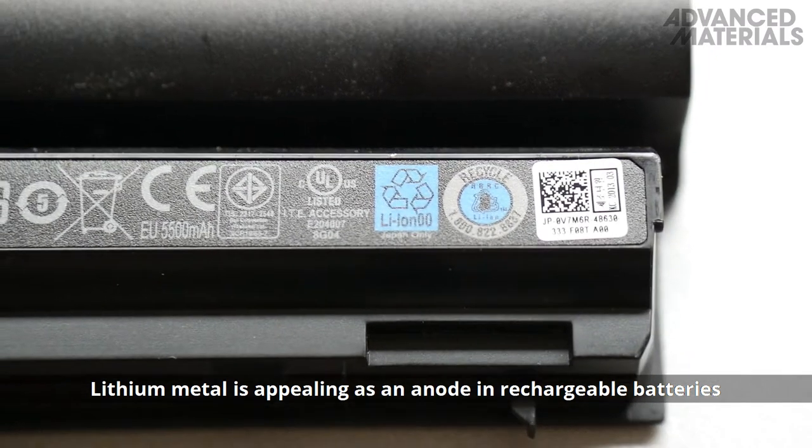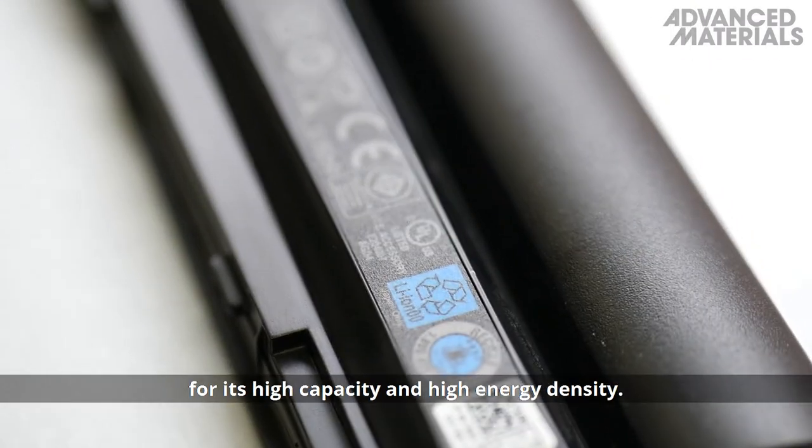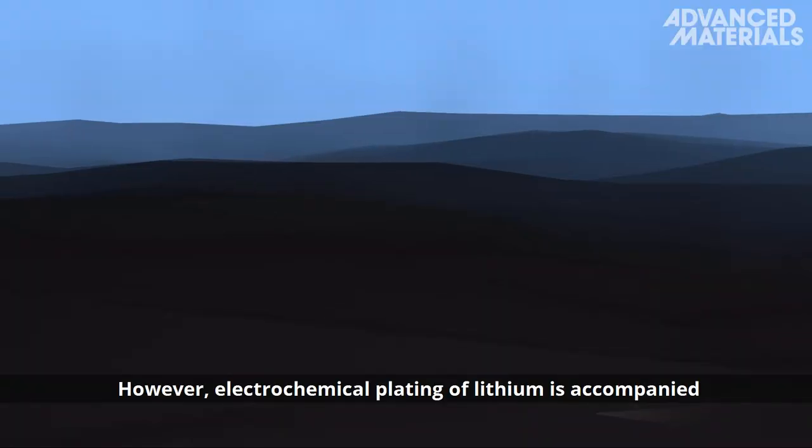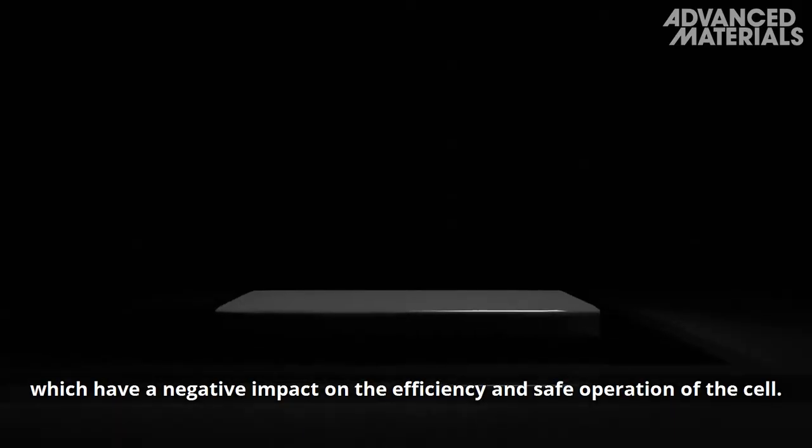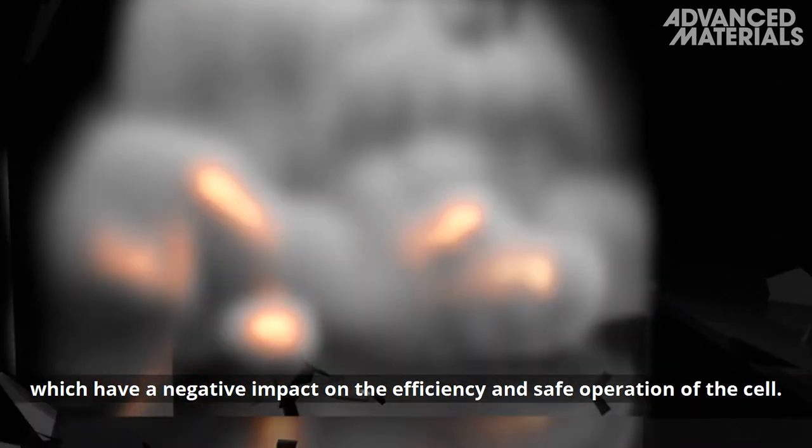Lithium metal is appealing as an anode in rechargeable batteries for its high capacity and high energy density. However, electrochemical plating of lithium is accompanied by the formation of lithium dendrites, which have a negative impact on the efficiency and safe operation of the cell.